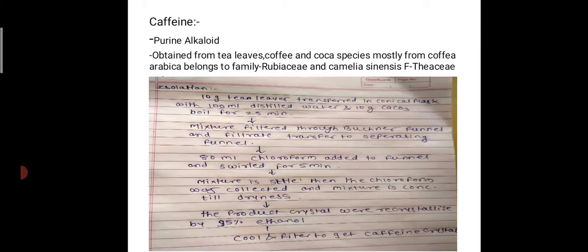The mixture is settled for some time, and after that the chloroform from this separating funnel is collected, and the extract or residue is concentrated till dryness to evaporate the chloroform. Then the product crystals are recrystallized with 95% ethanol.